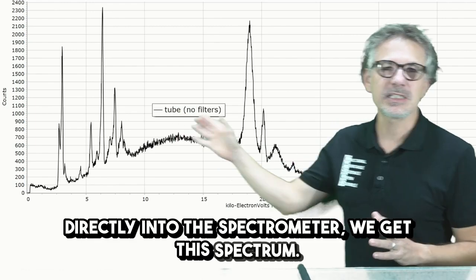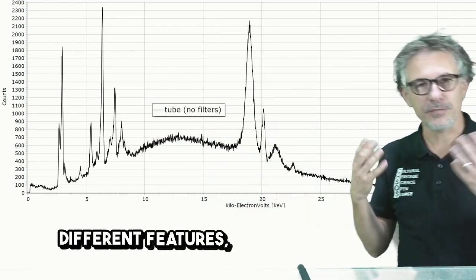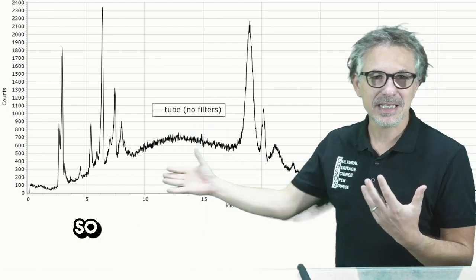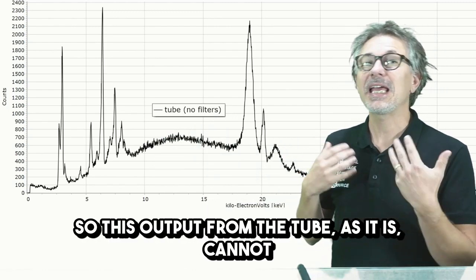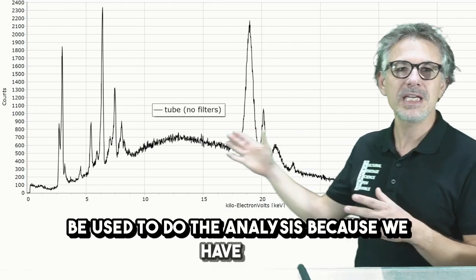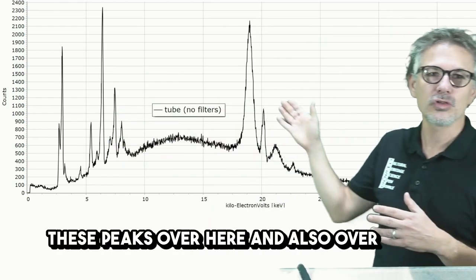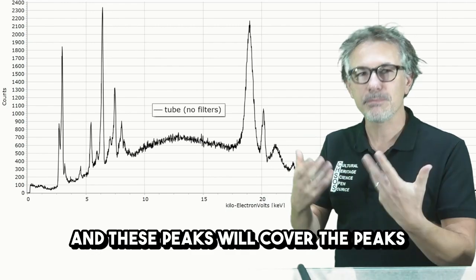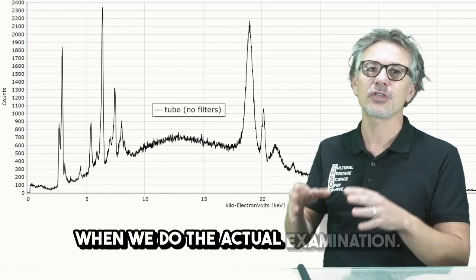We get the spectrum. So you see, this spectrum has different features. This spectrum as it is, so this output from the tube as it is, cannot be used to do the analysis because we have all these peaks over here and also over here, and these peaks will cover the characteristic peaks of the material when we do the actual examination.